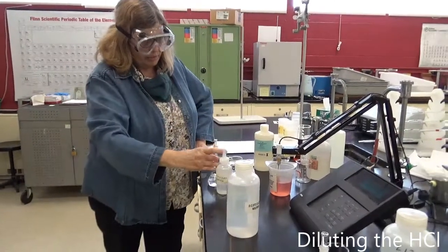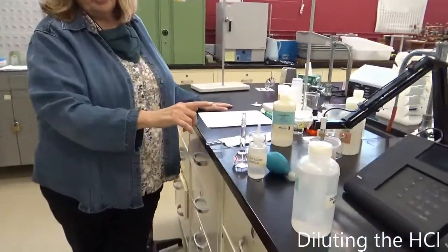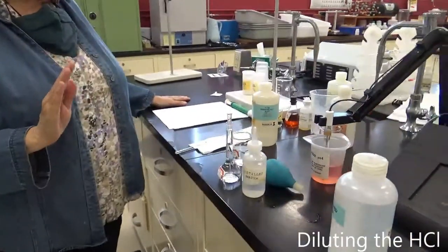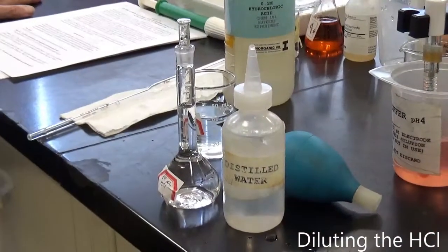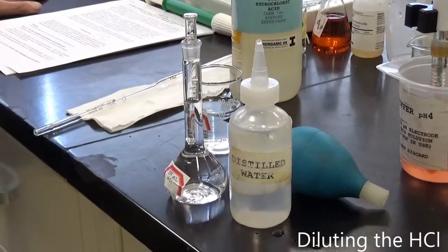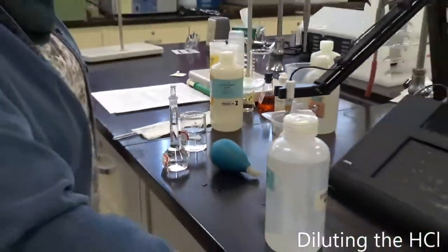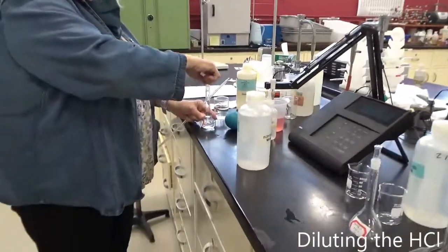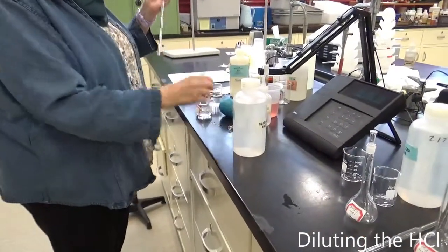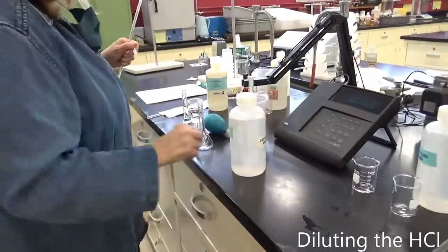Okay, so when I put that 5 milliliters in here, I added water to it. I didn't add any more HCl. So the amount of HCl in here is the same that was in the 5 milliliters, but now it has a volume of 50. That's why it's a tenfold dilution. So now I'm going to take a clean pipette, and I'm going to take 5 milliliters of this solution and dilute it again by a factor of 10.